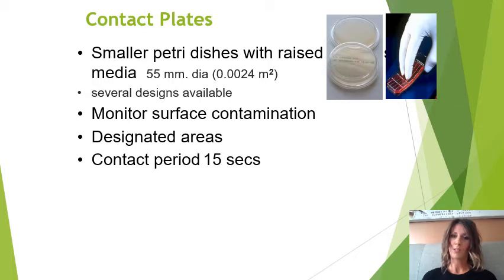With our contact plates, we are generally making sure that the cleaning of that surface is sufficient. Normally this is done in designated areas around the clean room, which will be decided as part of your validation process. And you need a minimum contact period of 15 seconds. That's so that the microorganisms have an opportunity to adhere to the agar surface.